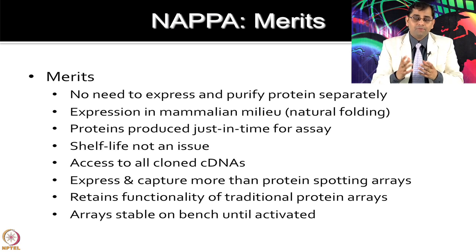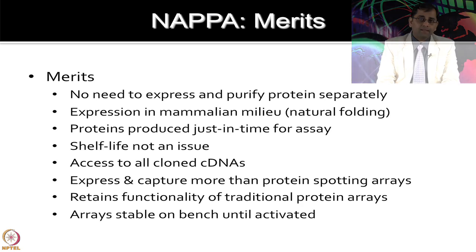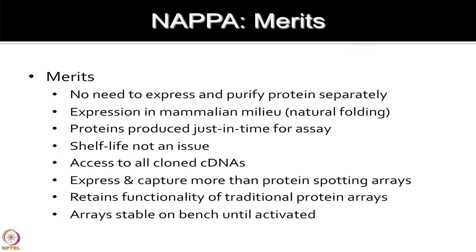Hopefully, the proteins which are expressed are also maintaining and retaining their functionality, but it has been shown from other experiments that these proteins do maintain their functionality and they are very stable on the bench until you are activating them with the IVT mix and incubating at the right temperature.